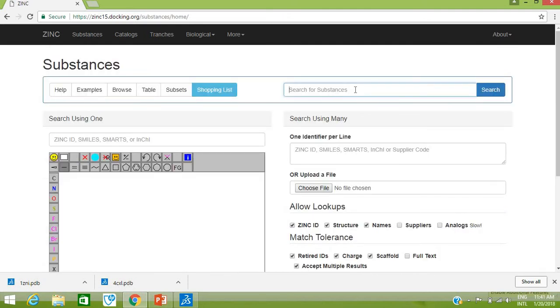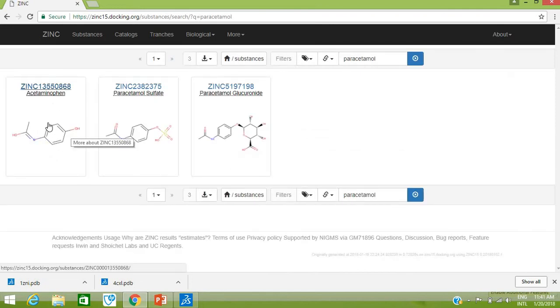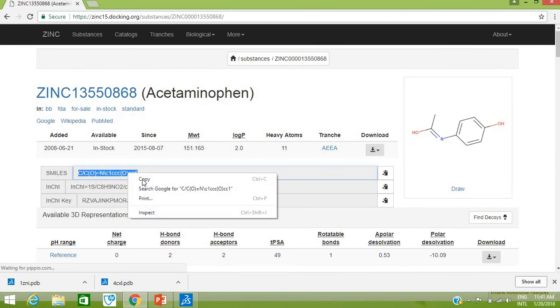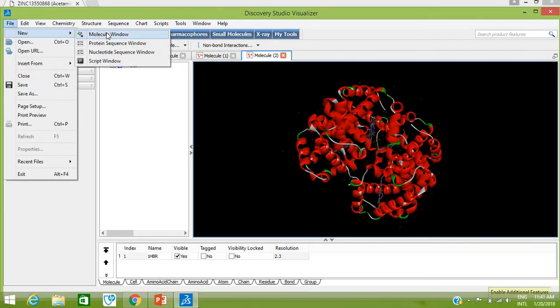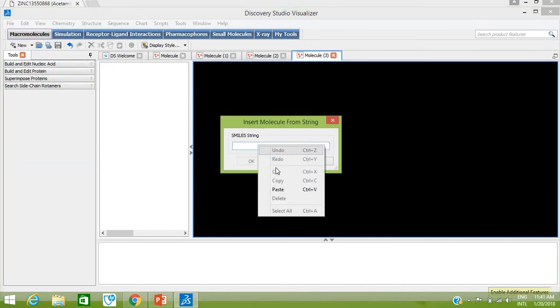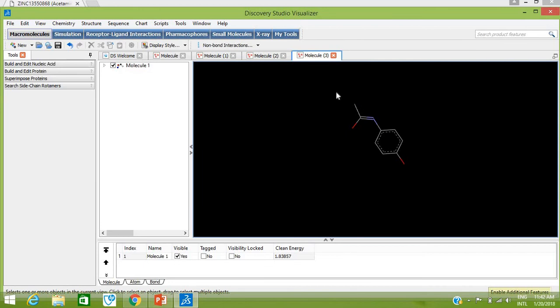Search for a drug, for example paracetamol. This is the structure of paracetamol. Click on this structure — here is the SMILES of paracetamol. Copy this SMILES, go to your Discovery Studio Visualizer, open a new Molecular Window, then go to Insert From SMILES. Paste your copied SMILES here — this is the SMILES of paracetamol that we just copied from ZINC15 database — and click OK. This is the paracetamol structure inserted into the current window.